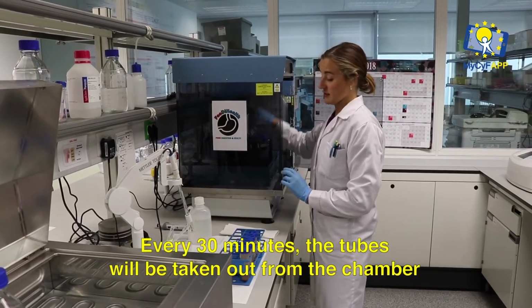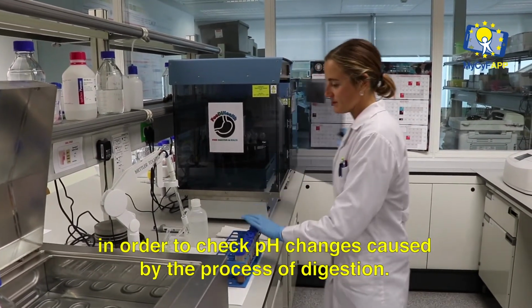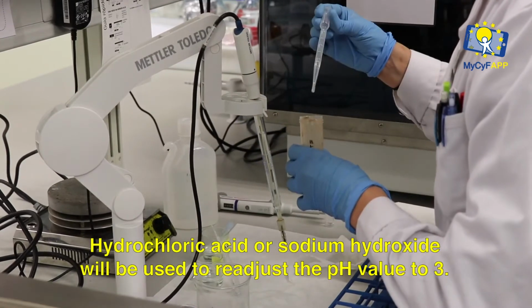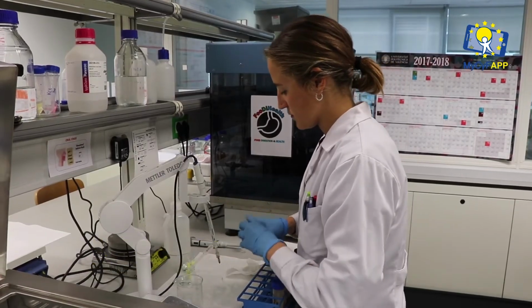Every 30 minutes, the tubes are taken out from the chamber in order to check pH changes caused by the process of digestion. Hydrochloric acid or sodium hydroxide can be used to readjust the pH value to 3.